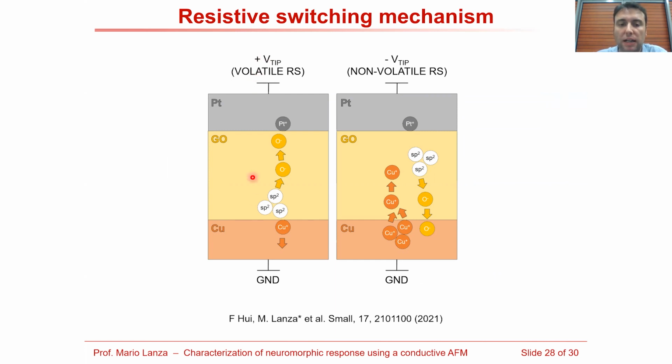When we apply a positive stress to the platinum electrode, the platinum is a noble metal and it has a very low diffusivity. And therefore, the conductance change in this material system is normally produced by the migration of oxygen atoms, which produces some oxygen vacancies. When we apply the positive bias here, copper ions don't enter because copper ions are positive and they will move in the opposite polarity. So this is what leads to the volatile resistive switching regime.